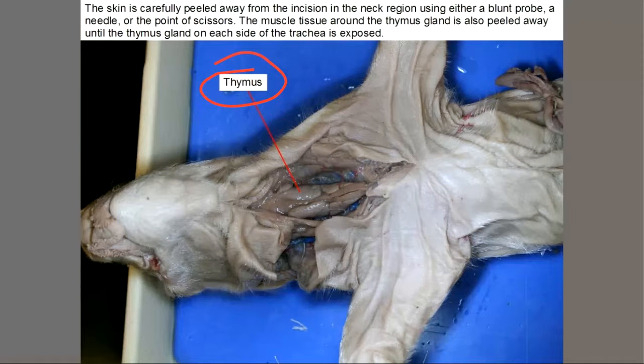Okay. So there's a lot of tissue that you have to cut through, and there's a lot of work that you have to put into it to clear all the organs that you want to see.